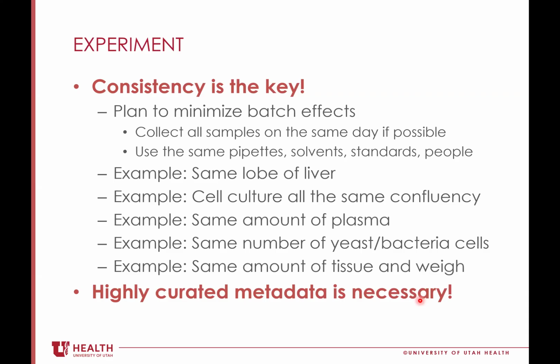We do and have done a lot of liver metabolomics, and the liver has a large amount of variability across it, so we really prefer to get the same lobe of liver from every sample. And Judy Simcox, when she was here at the U, she's at Wisconsin now, would freeze clamp the livers in the mouse, and then use very specific lobes to do her work, and that worked out really well. She had outstanding data.